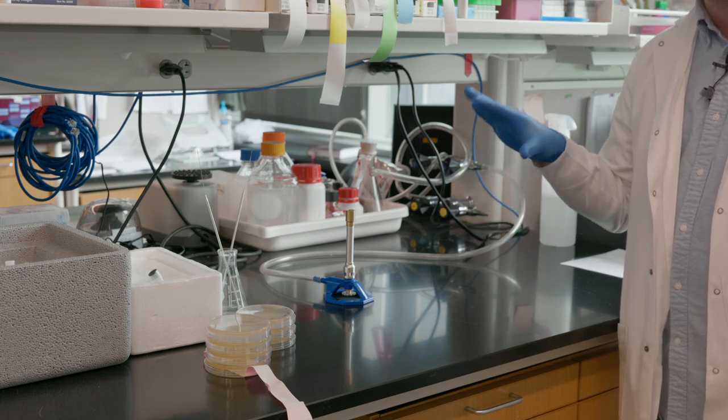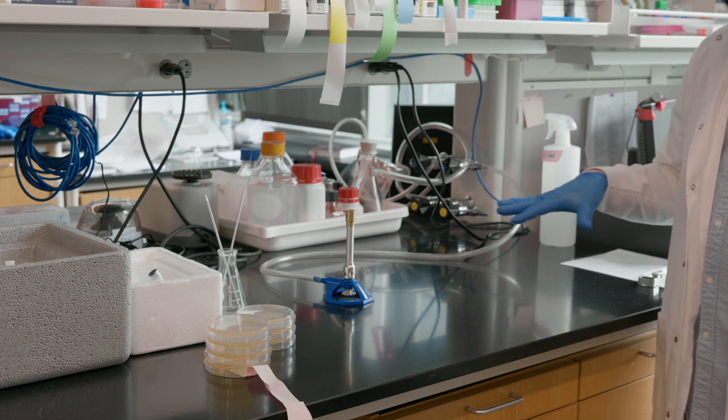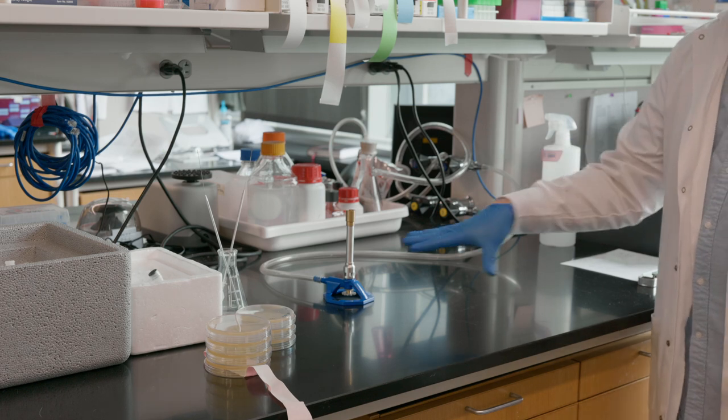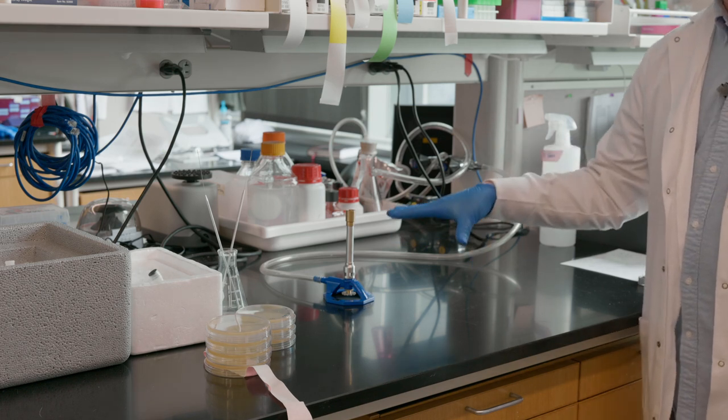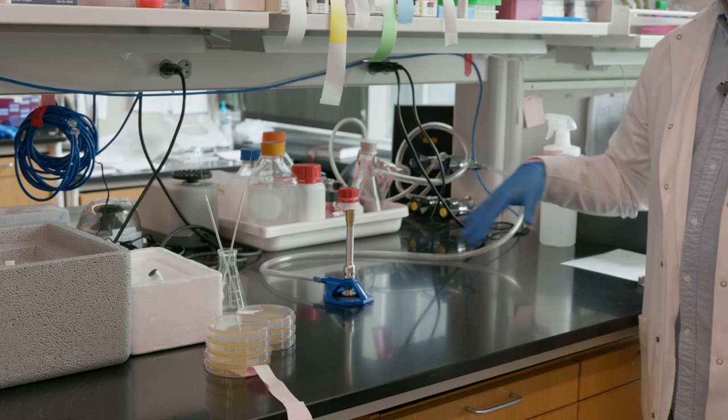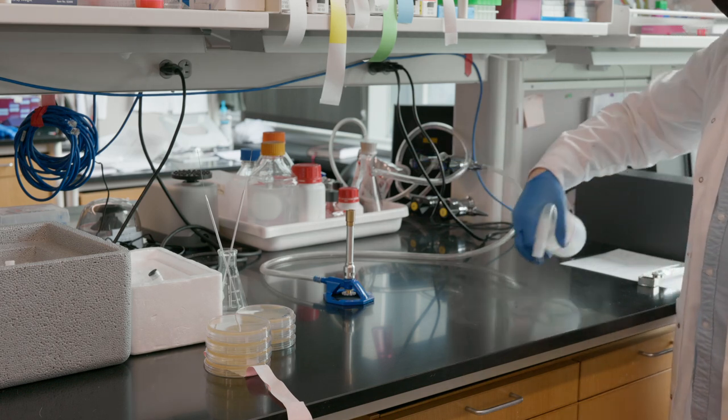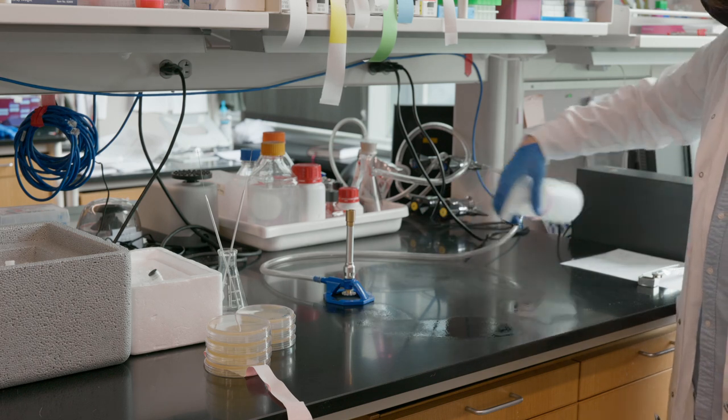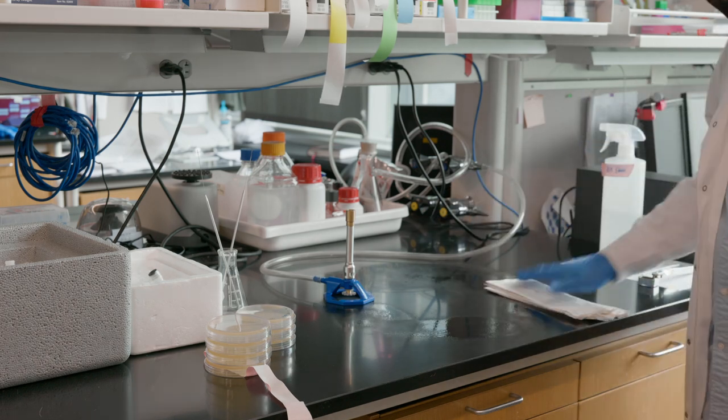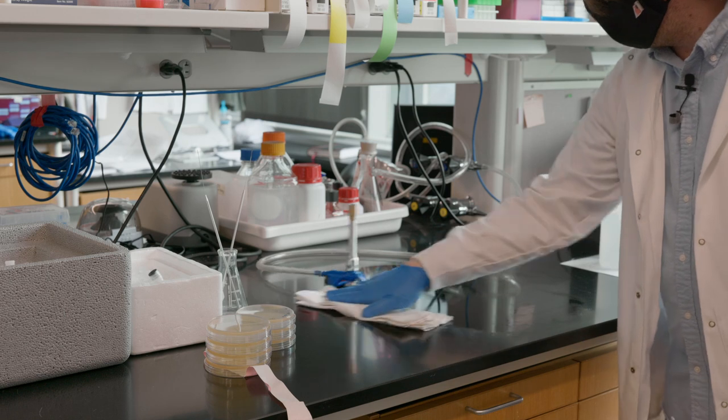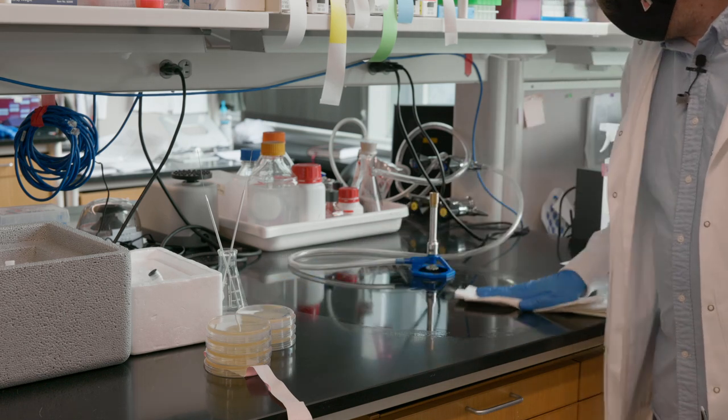So we're going to start by spraying down the area and then turning on the Bunsen burner. The Bunsen burner will allow the air to circulate and prevent the dust particles in the air from settling into your plates. So first, like that, this whole area, good solid wipe down.